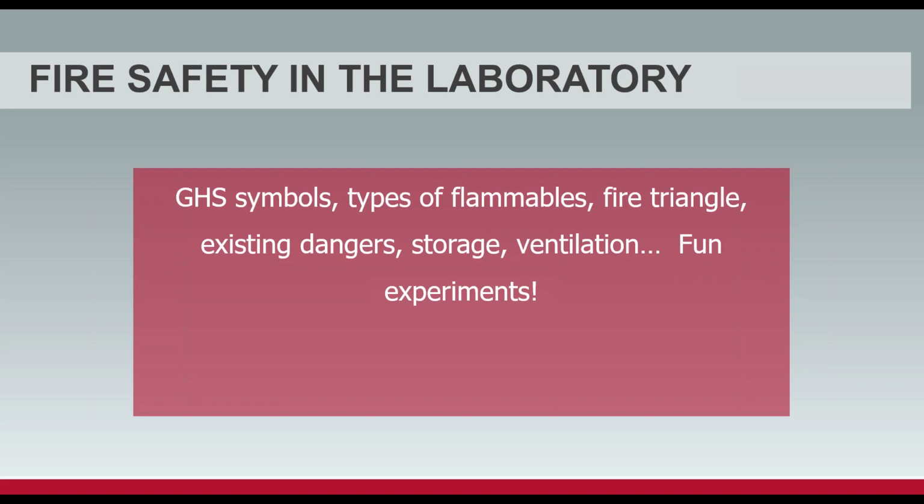At the end, time permitting, I've got a fun little video that I want to show you that talks about compressed flammable gases. Traditionally, that's a whole different presentation, but if I've got time, I'll show you that. If not, we'll fly back through it. We're going to spend a lot of time talking about the fire triangle. As design professionals and manufacturers, that's the one thing that we can help mitigate the dangers of fire. The fire triangle has three different sides, and if we can segregate those sides, then the possibility of fires or explosions doesn't necessarily exist.